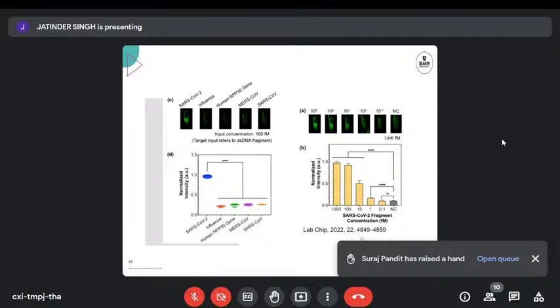This is just one example of a very easy to use, very practical for in-field use, DNA RNA amplification and detection device. As I just said, there are a couple of review articles mentioned in the notes of this lecture. If you've got an interest in DNA or RNA amplification on a chip, please look for something that's close and similar to your application of liking, and then you'll find yourself a way through.